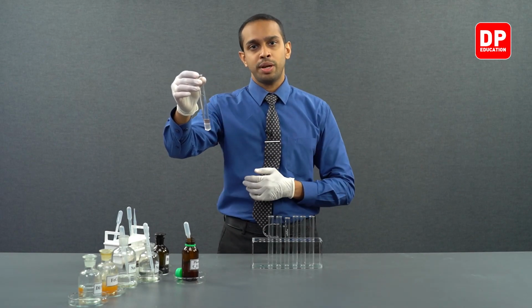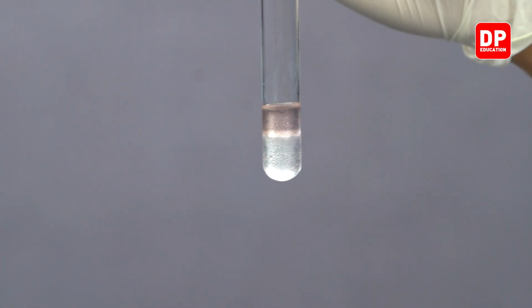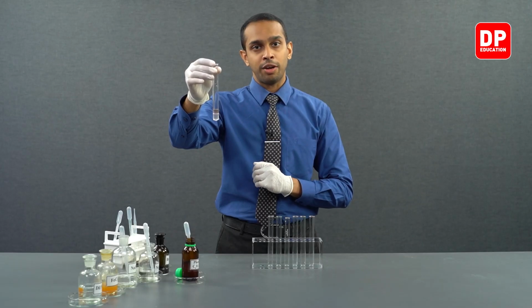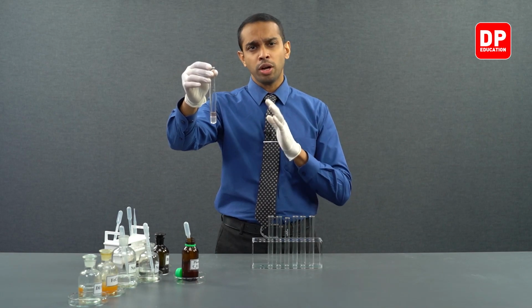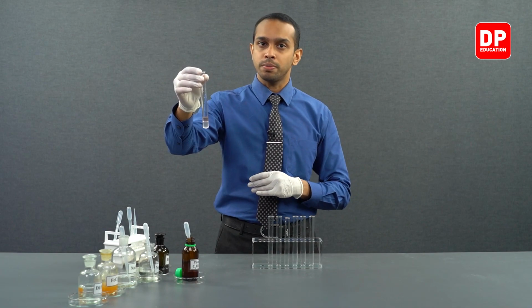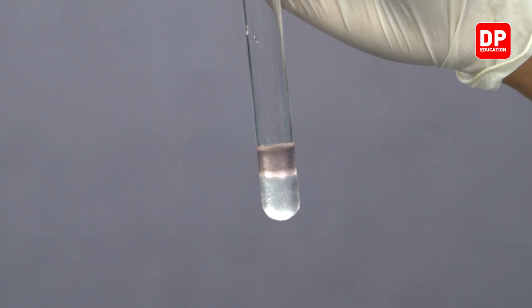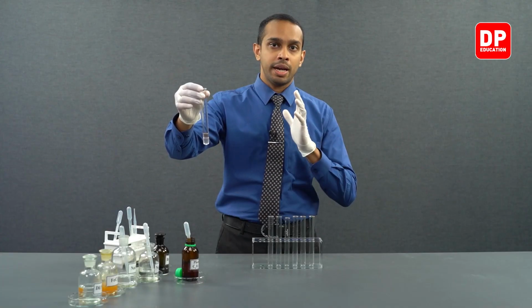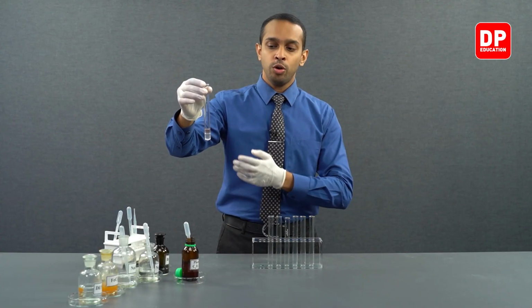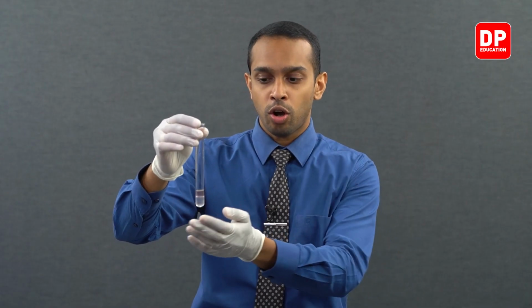In this reaction, we saw when you mixed phenol with sodium carbonate, and when we mixed it well, we did not see any gas evolving from this mixture, indicating that phenol did not react with the carbonate anion. So therefore, we do not see formation of carbon dioxide gas. We did not observe any bubble formation or effervescence in this mixture.